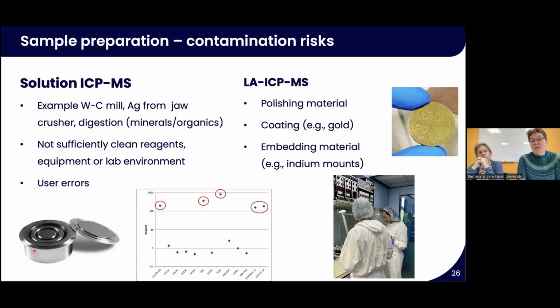So after quite a while we figured out that some of the samples had been crushed in a jaw crusher, and some of the metal bits that the rocks chipped off the jaw crusher had been incorporated into our powder. These things can happen, and sometimes they're obvious and sometimes they're not, and sometimes you just have to painfully learn that you have contaminated your sample afterwards.